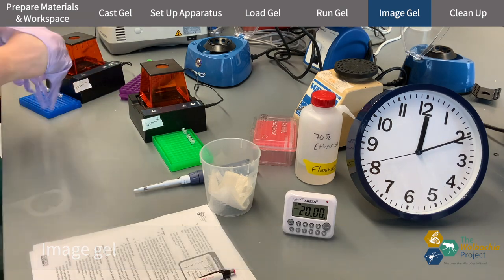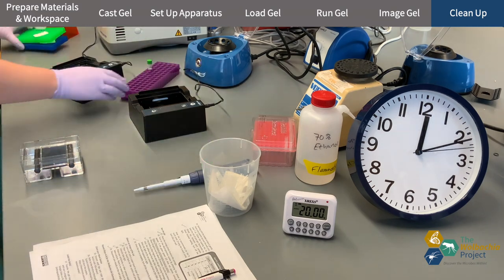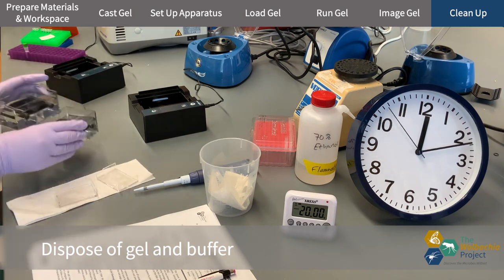I turn everything off and remove the buffer tank from the black carriage. I pick up the clear plastic tray with the gel on it and throw away the gel, but keep the plastic tray.